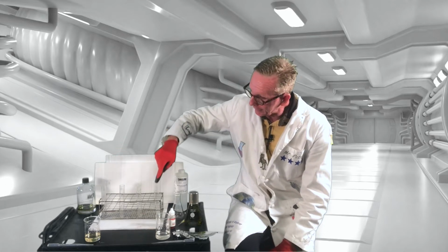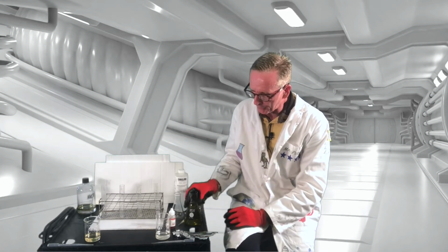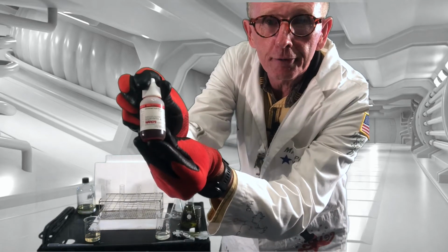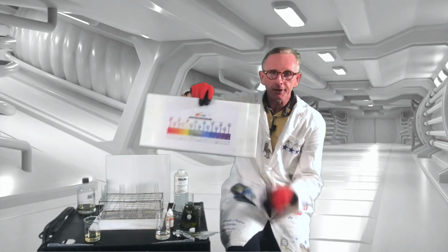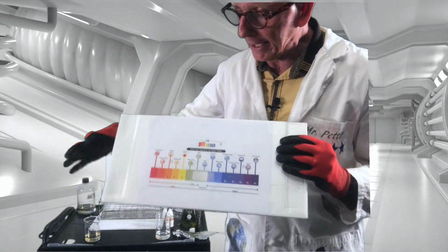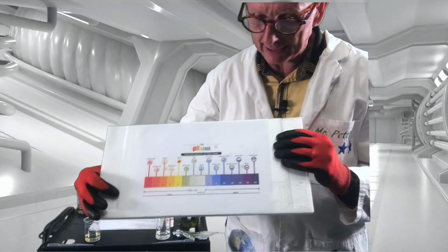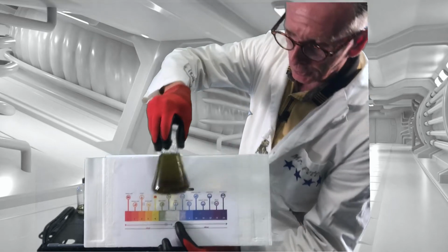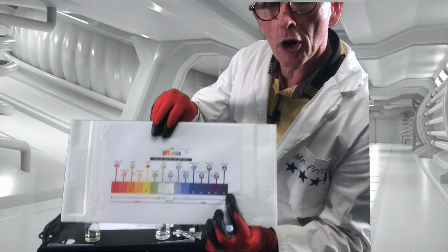What happens when a strong acid interacts with a strong base? Well, let's go back to our old friend, universal indicator. Now I've already got it mixed up, but universal indicator, we mix it in and we have a nice chart. Gives us our color. Acids, hydrochloric acid on this end. Acids tend to show up as a red to bright pink. Neutral colors are in the center, so we have a neutral. And our blue towards purple for strong base.